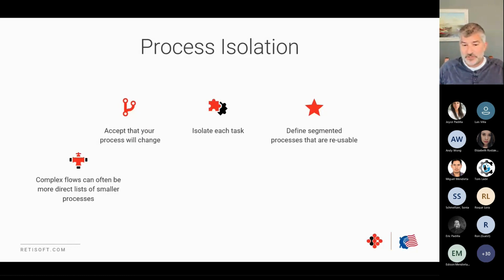So often doing this turns your larger flows then into just a linear series of these smaller sub-processes. This is really important because it helps ease maintenance of any software or hardware systems by limiting how many permutations of process you're actually dealing with. If I actually had the vitals listed as a sequential process, and sometimes I cared what order they were done in, right there, I've got multiple variations of just a simple 4-step process.